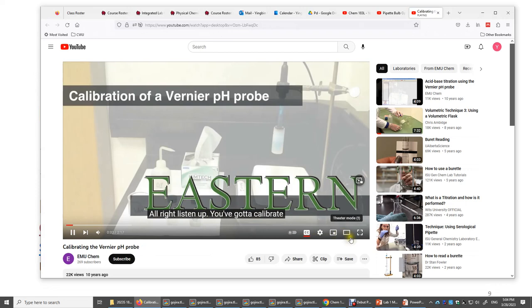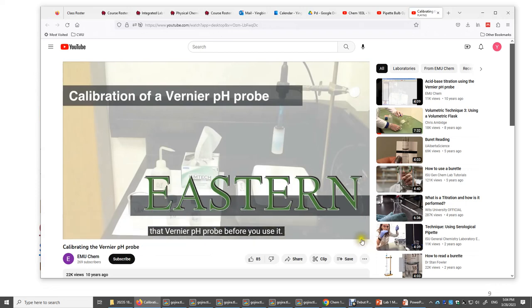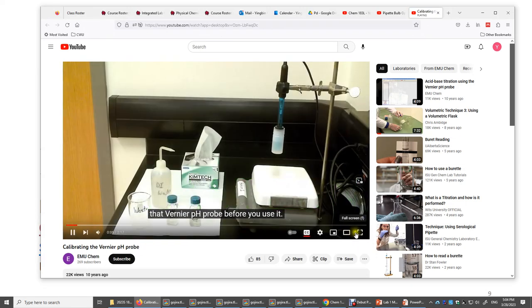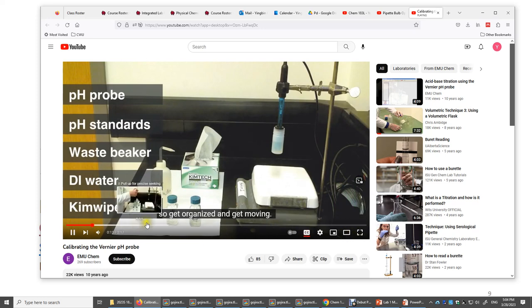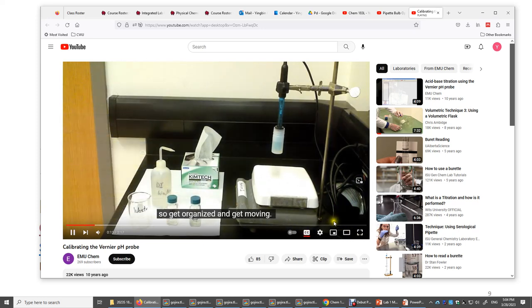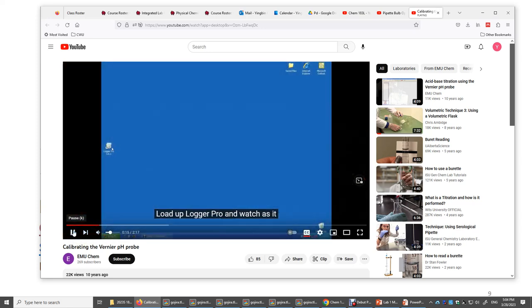You need to calibrate the Vernier pH probe before you use it. You'll need a few things in addition to the pH probe, so get organized. First, load up Logger Pro.